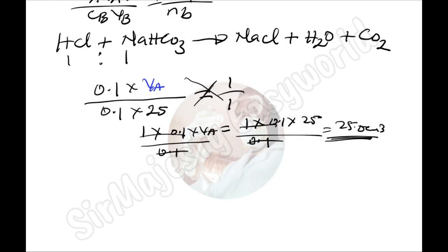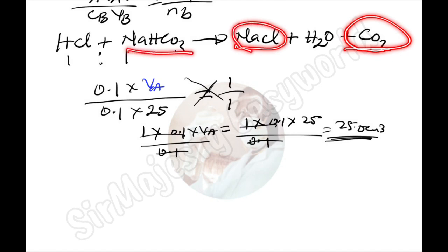Remember, you might be asked precautions, then know how to calculate the volume of CO2 evolved at STP, know how to relate the mass of salt formed with the acid salt or equally with the HCl. There are many possible questions that can come. Then you do yourself a favor to watch many of my tutorials here on titrations and possible questions, or you can equally come for private coaching if you need more, or watch most of the free videos.